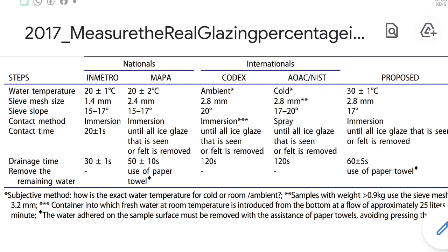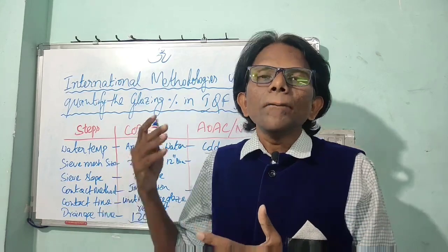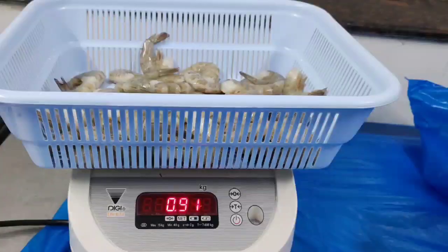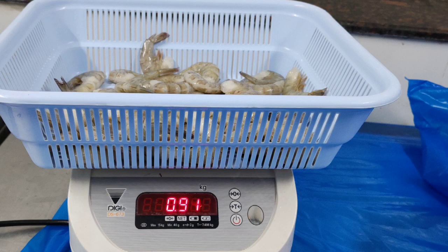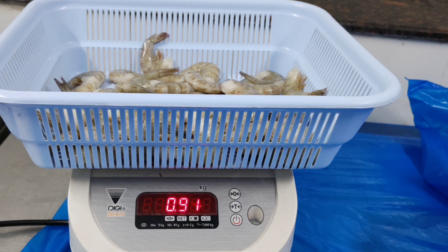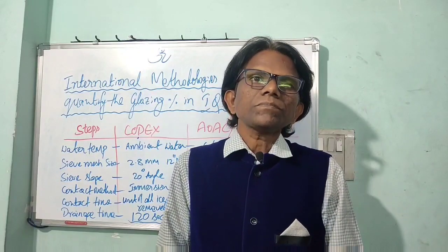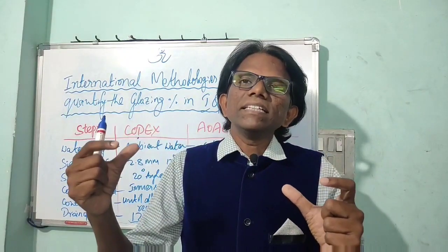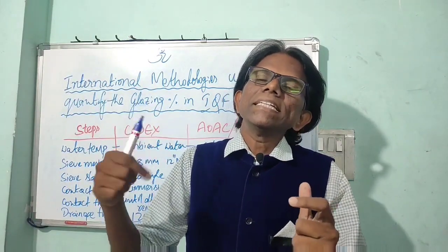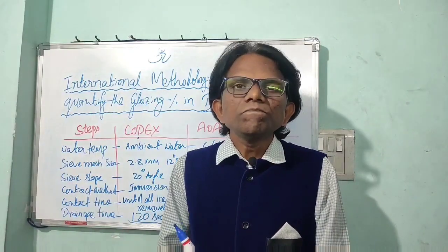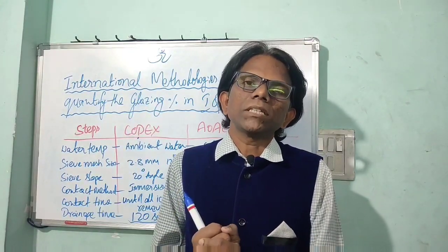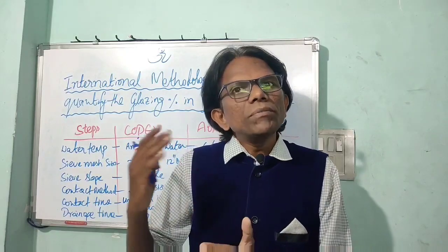After 120 seconds of drainage, transfer the material into the receiving pan. Since you have already recorded the tared weight of the receiving pan, take the final weight. The glazing percentage formula is: (Frozen Weight − Deglazed Weight) ÷ Frozen Weight × 100. This gives the glazing percentage of the shrimps, which is used to determine the filling weight for online packaging.